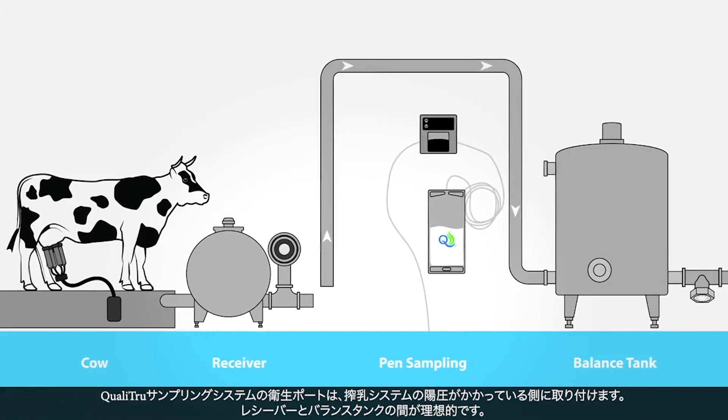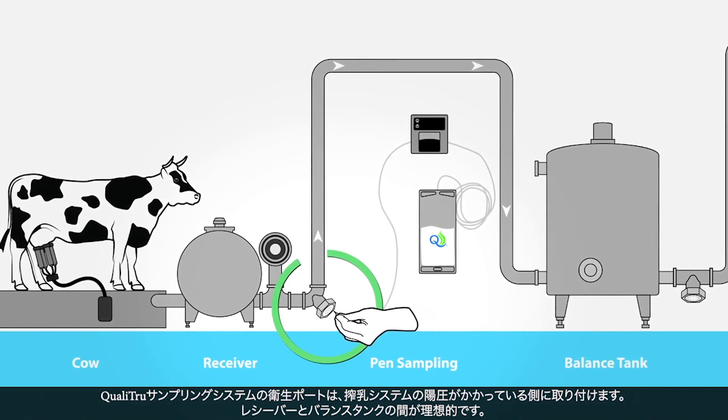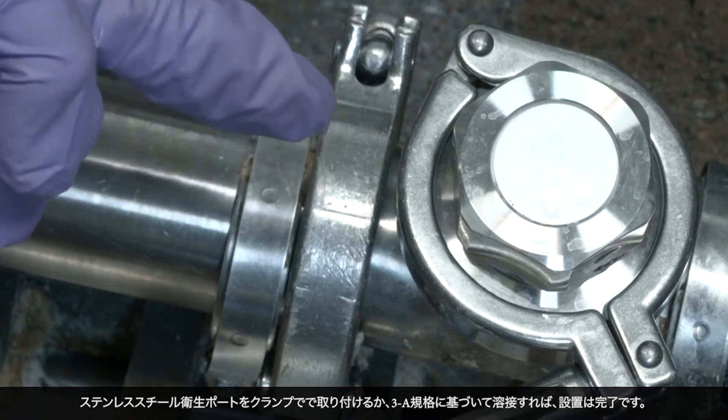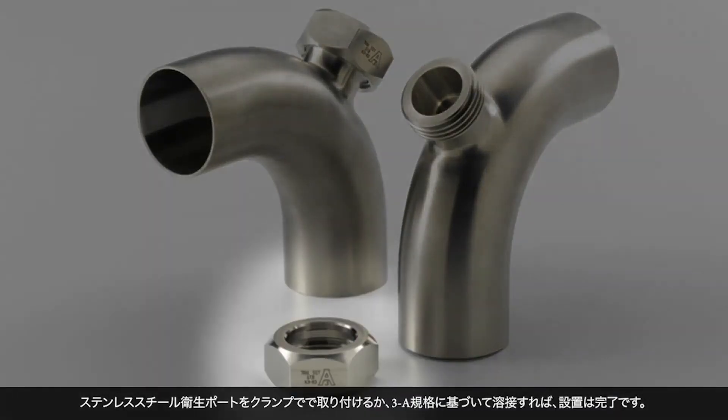Installation of the QualiTrue sampling system sanitary port should be placed on the positive pressure side of the milking system, ideally after the receiver and before the balance tank. Installation can be completed by either tri-clamping a stainless steel sanitary port into place or welding it into place by a welder that recognizes 3A design standards.